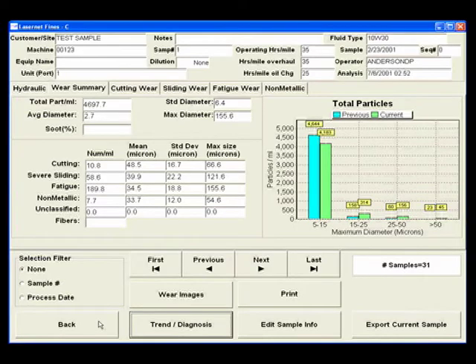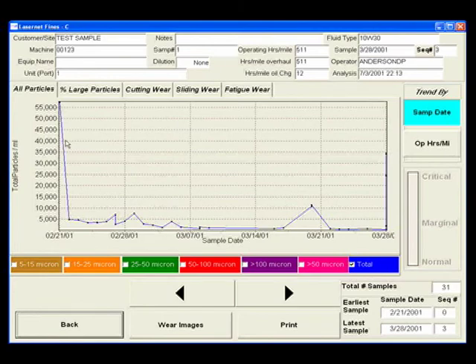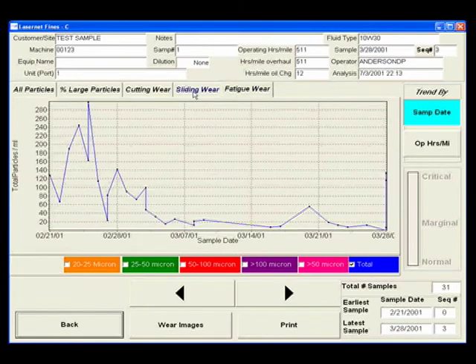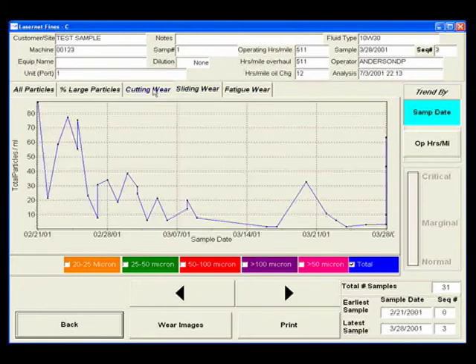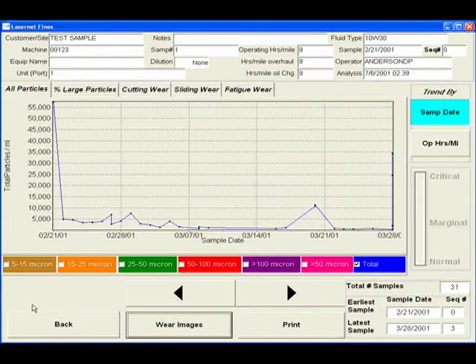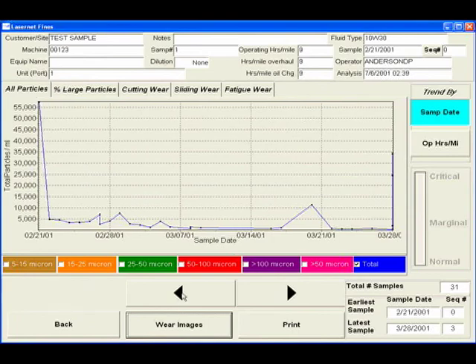Another distinct feature of the LNF software is its ability to trend different types of wear. For instance, the user has access to graphical representation of all the different wear types as well as the size distribution. Trends can be tracked according to the sample date, the sample number, mileage, or operating hours of the machine.